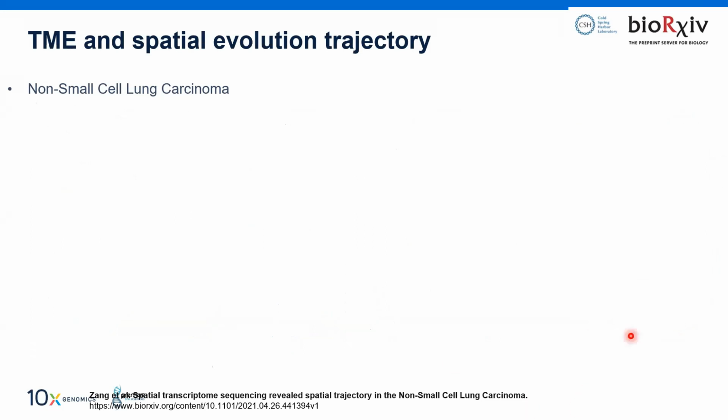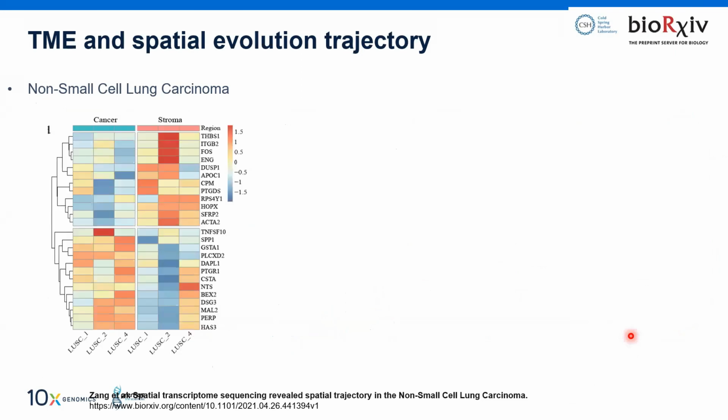Now, they tried to dig out more information from this sample. They did the cancer and stroma study, and they cataloged gene expression patterns of specific genes that are responsible for invasion, migration, or cancer stages and everything. They cataloged these as heat maps. If you look at the cancer one only, the heat maps of those genes are totally different, and because the tumor microenvironment also regulates, you can see very different heterogeneity across these samples.